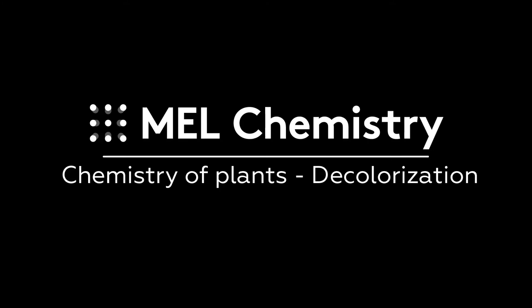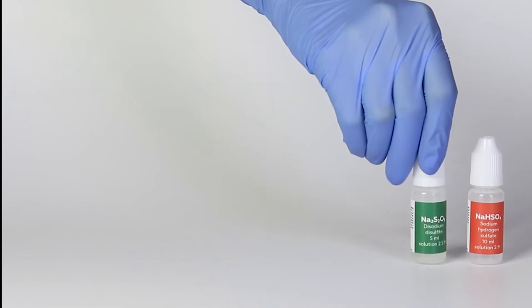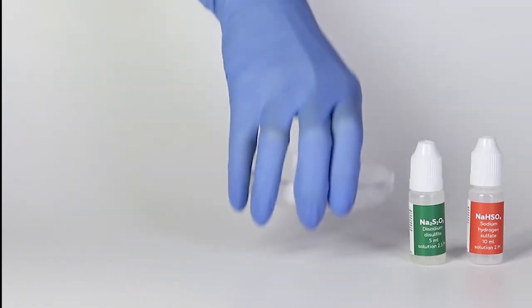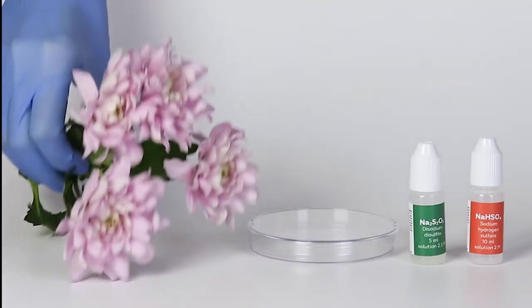For the decolorization experiment, you will need solutions of sodium hydrogen sulfate and sodium pyrosulfite, a petri dish, and some flowers.